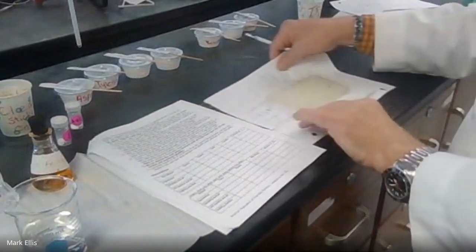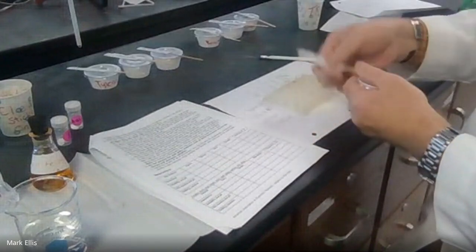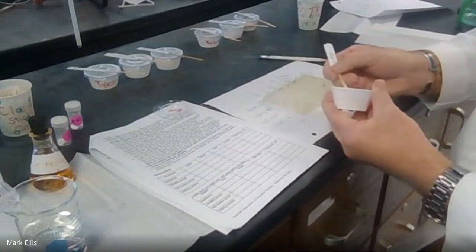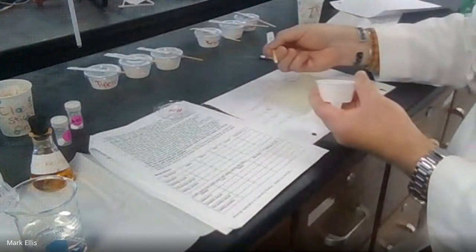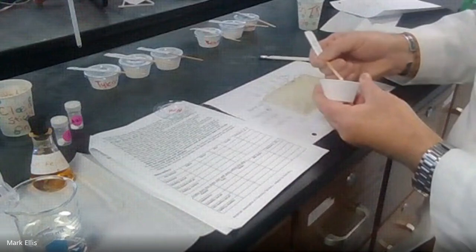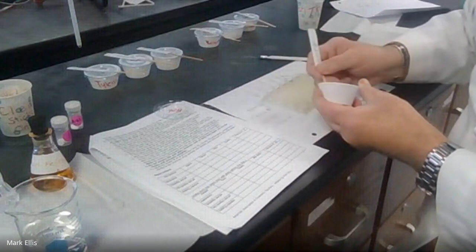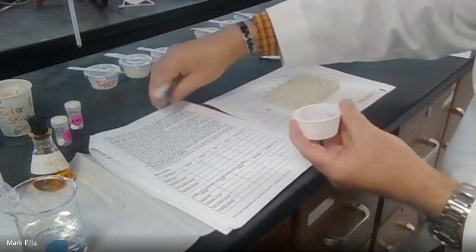So we only need just a few granules. So I need to put, the first column is aspirin. So I'm going to put just a little tiny little bit of aspirin in each one, just barely enough to see on the end of that stick. Be careful that you get it in exactly where it goes. So aspirins are in the first column only. I'm done. Put the cap back on.